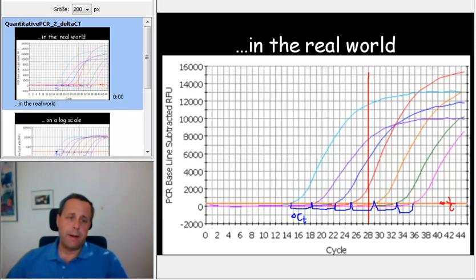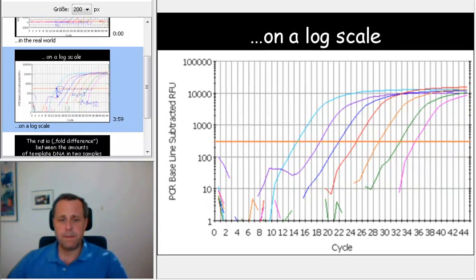And in order to do that a bit better, we switch to a different view of our amplification curves. And that's something that I would like to show you here. So what you see here is the same amplification curves as before but now it's on a log scale. Log scale meaning that this is 10 units of fluorescence, this is 100, this is 1000, 10,000 and 100,000. The cycles are still plotted the same way as before from cycle number 1 all the way to cycle number 45.